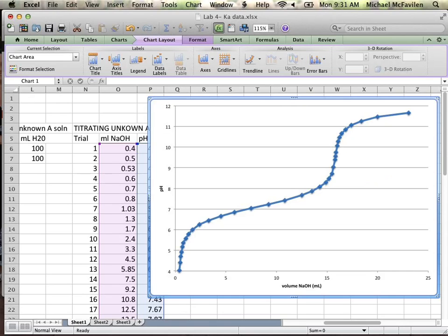Okay? I'm going to guess this was the second trial. Yeah. Okay? So that's why we kind of staggered the two people doing the titration. The first person could go through, find out where the pH spiked, and tell the second person to make sure you get a lot of data points through there. Okay, that was our goal.